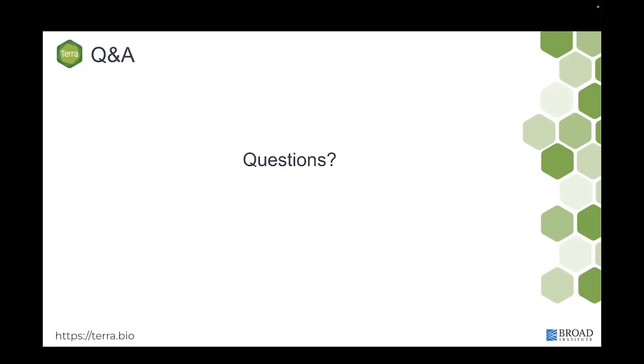And with that, I'm going to thank everyone one last time and open the floor up to any other types of questions. We have about 10 minutes left, so you've made great time. I see a question. What is the most effective way of exporting results in order to minimize egress? That's a very interesting question. I feel like several of the TAs could weigh in on different answers. Yeah, it's a great question.